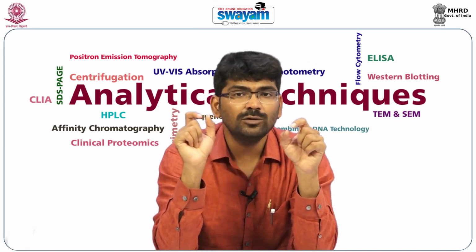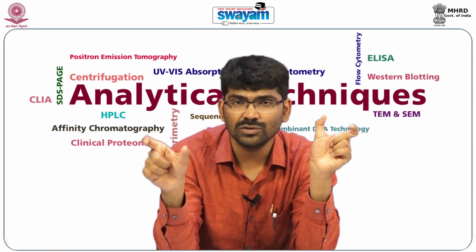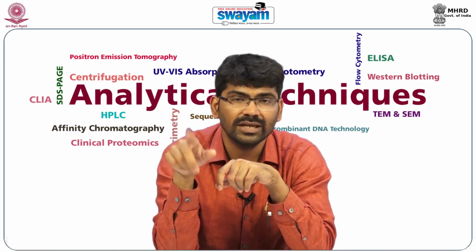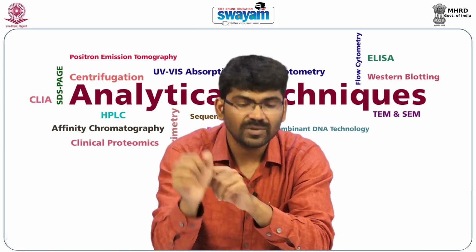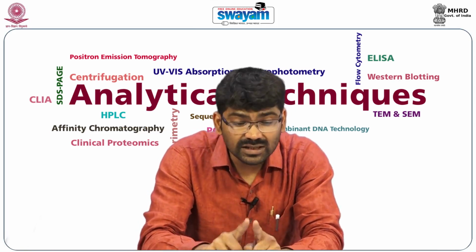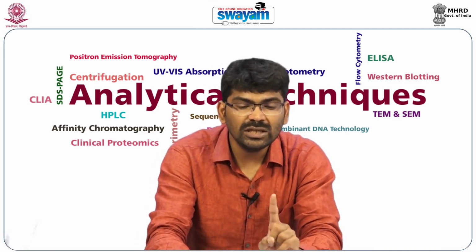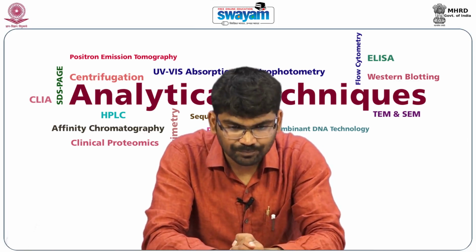There is a formula to convert relative centrifugal field and revolutions per minute. So RCF is equal to 1.12 into radius into RPM by 1000, the whole square. Maximum speed during centrifugation is achieved with the fixed angle rotor. Density gradient centrifugation is done using a swinging bucket rotor with brakes off.